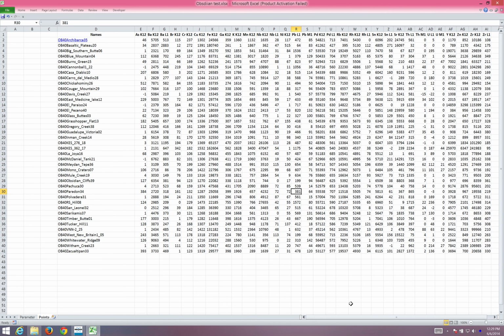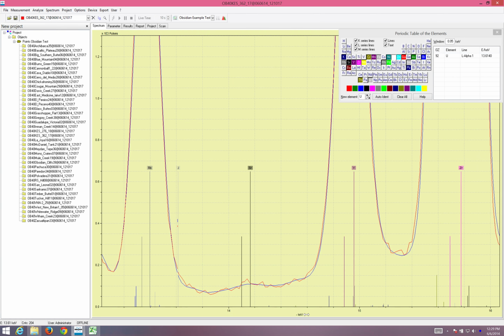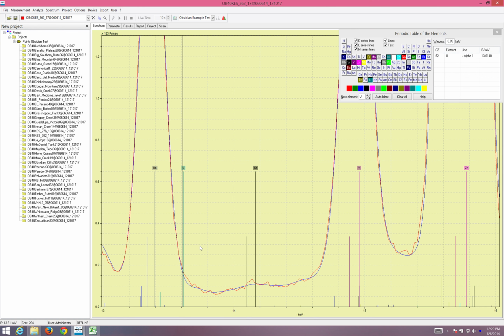Now, remember earlier we were discussing uranium. With uranium, we had only a small difference. Here in Artax, you can see it. If I run my deconvolution without uranium, it's only a narrow shoulder. If I run it with uranium, I see it fit a little bit better.